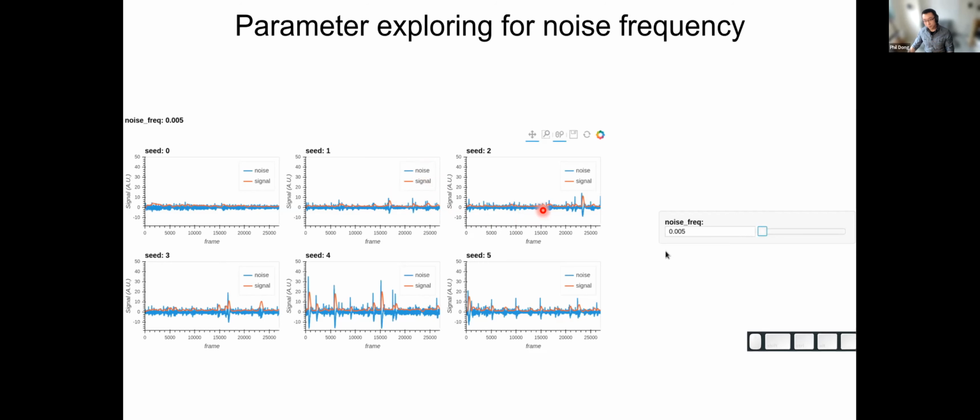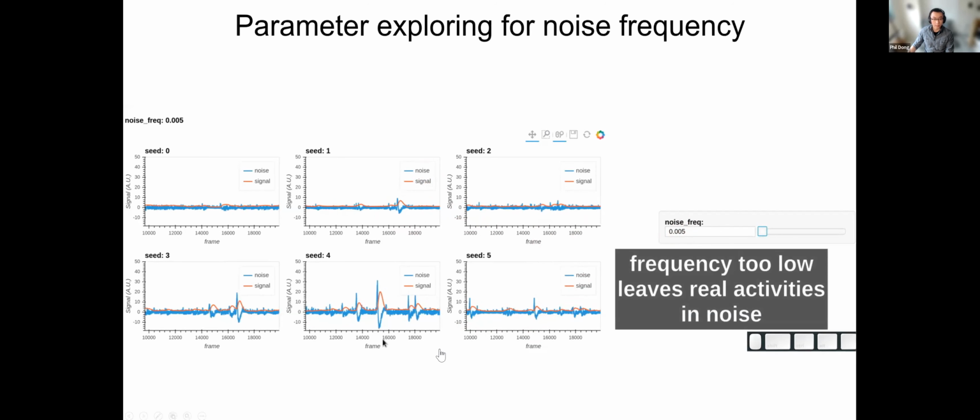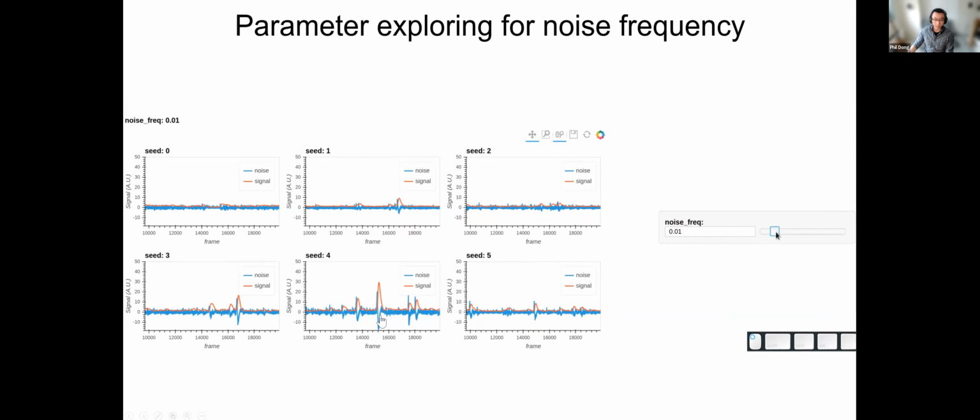As you can see, when we choose a cutoff frequency that's too low, every single fluctuation is in the high frequency component, the blue trace here. So let me play the video here. And you don't want that, because that's not noise. That contains real calcium activity.